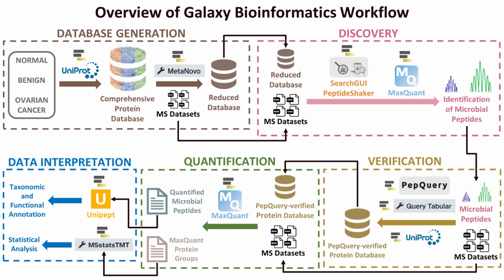Next is the verification module. We will use PepQuery2 to verify confident identification of microbial peptides to avoid misassignment of human peptides. We will then create a database of protein sequences associated with these verified peptides. This verified database will help us reduce false positives when we quantify our proteins and peptides.